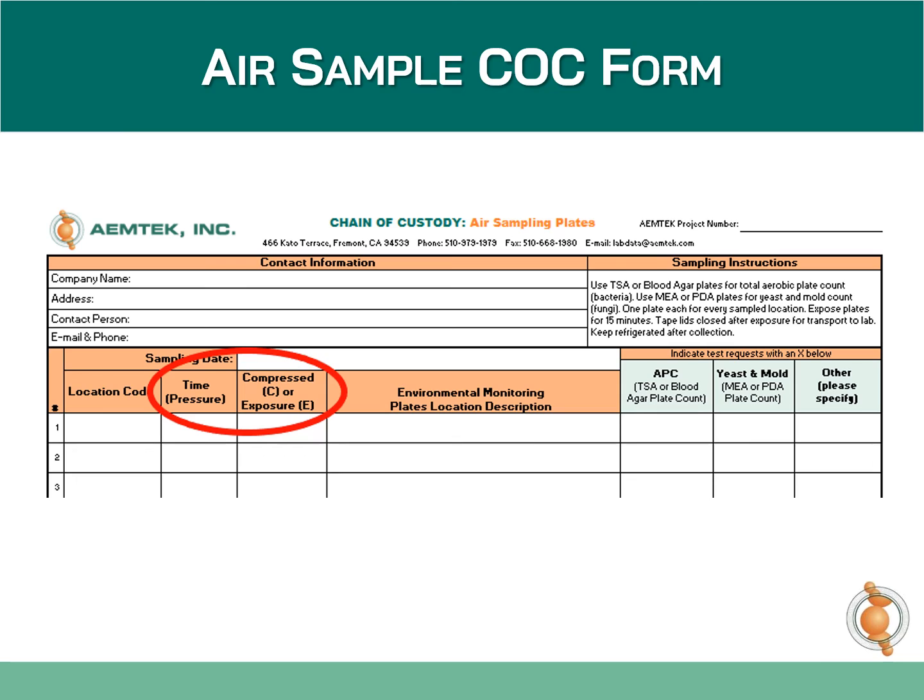When filling out the chain of custody form for air samples, please indicate if the samples are compressed air or exposure air samples. Also indicate the time for exposure air and pressure for compressed air. Always remember to have a unique sample description for each sample.